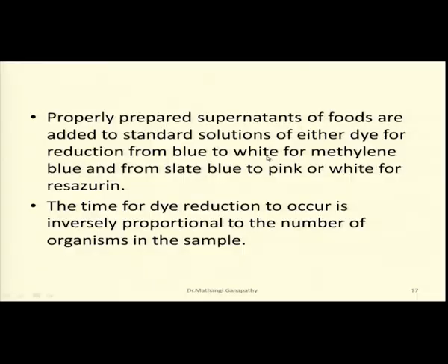Depending upon whether we are going to use methylene blue or resazurin, if it is methylene blue and the wash sample contains microbes, then you will see the change in color from blue to white as the microbe grows, or if it is resazurin, from slate blue to pink or white in color depending upon the microbial growth.